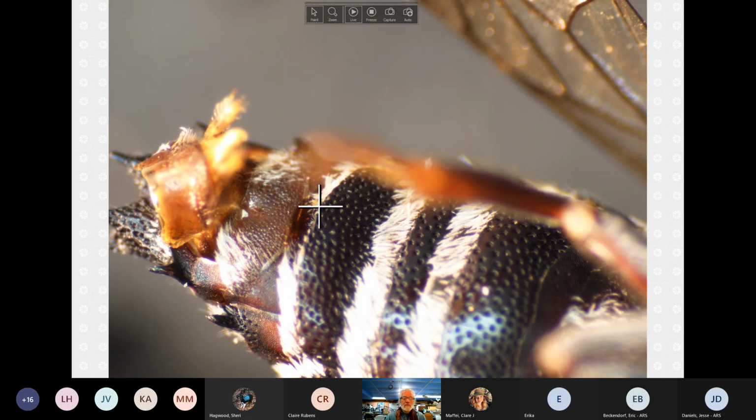But what's happening here, these both seem to be pretty clearly out curved. But in many cases, there can be a notch in the center. There can be something that's greatly concave. One can be concave and the other can be out, convex. So that pattern can be super useful. Anyway, bad example because the bottom has been torn up here.